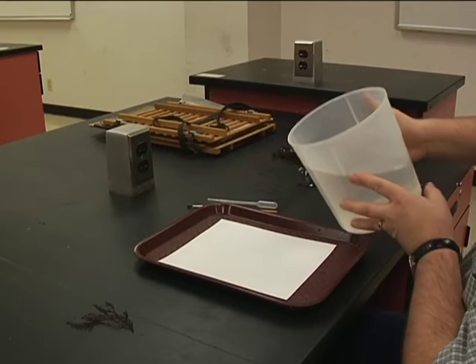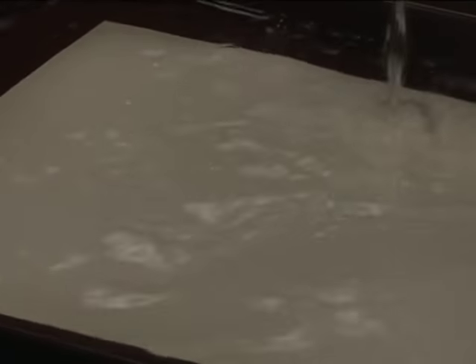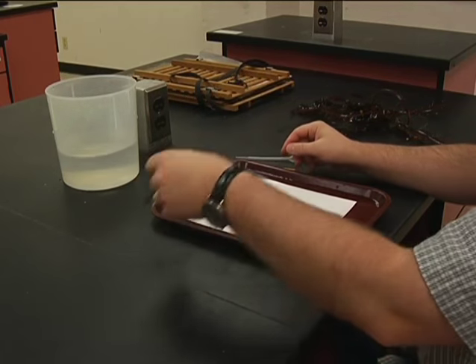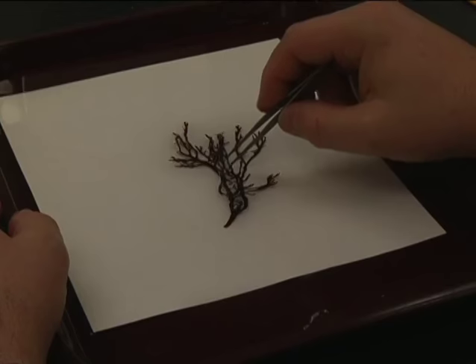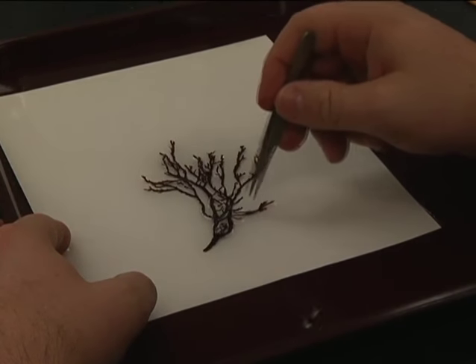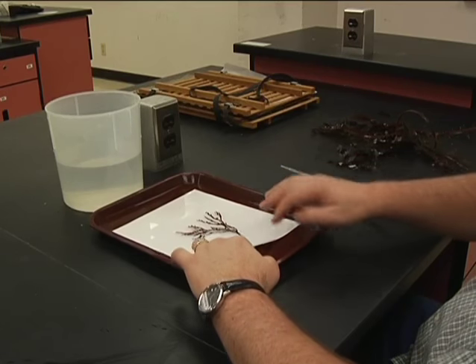Pour clean sea water into the pressing tray over a sheet of herbarium paper. Place your specimen on the wet paper and use forceps to arrange the stipes and blades to create a pleasing composition. If your algae is filamentous, use a paintbrush to gently position the blades. If necessary, trim the specimen of crowding blades to better show the natural branching pattern of the algae.